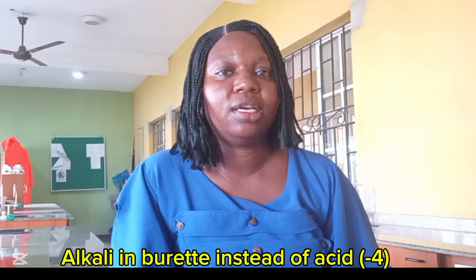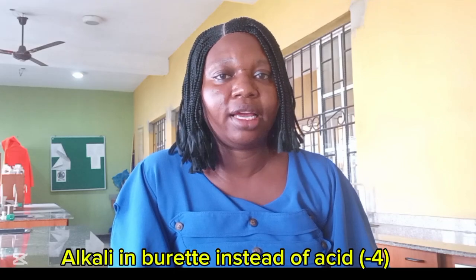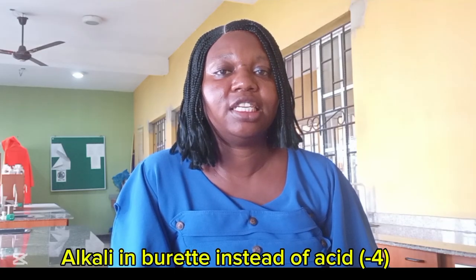Next is when you put alkali in the burette. Most of the time in WAEC, you put acid in the burette and we use our pipette for the alkali. So if through your record or through whatever you have been asked, we deduce that you put alkali in the burette, 4 marks will be deducted because that shows you do not know what you are doing.